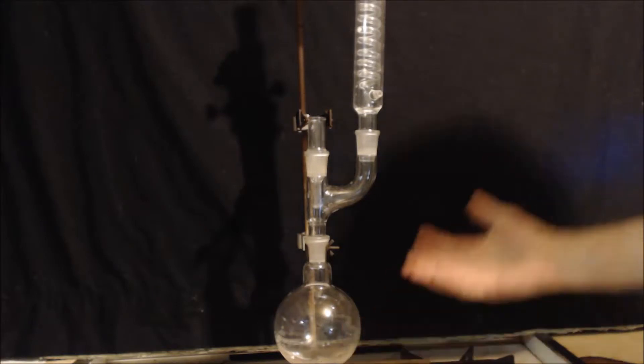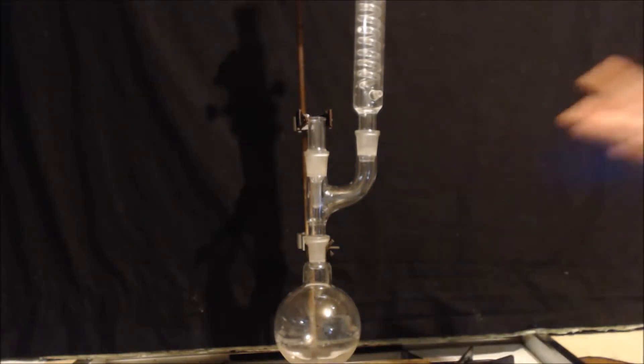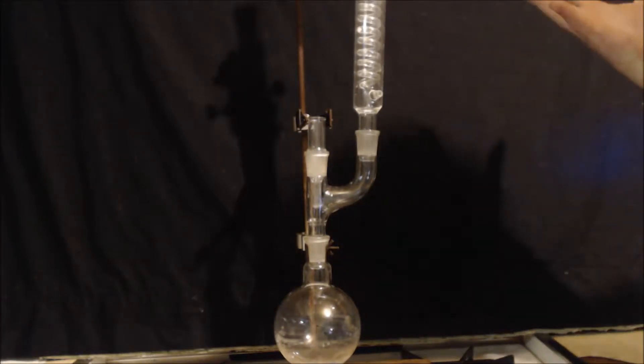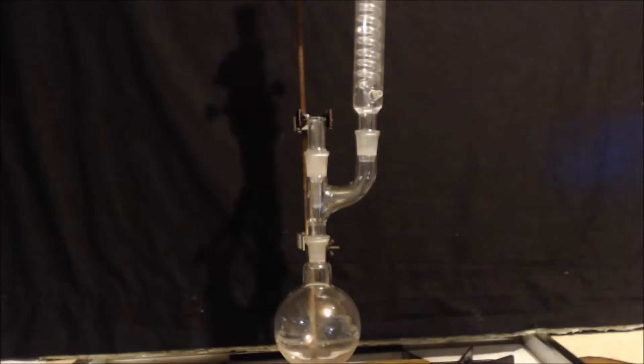So you're just basically boiling it so that you can make that reaction go faster. Sometimes you need it because you need that activation energy for the reaction to go. Other times, most times, it's about speed. Instead of waiting a week, you're going to do it in an hour. You're going to reflux it.